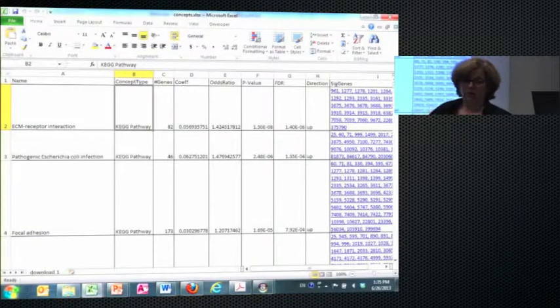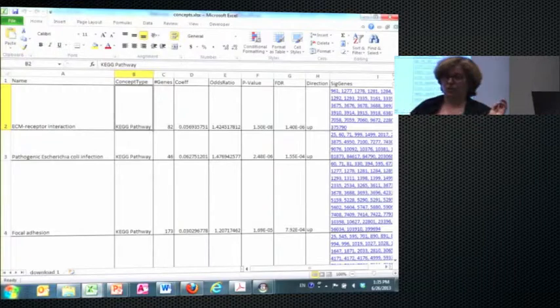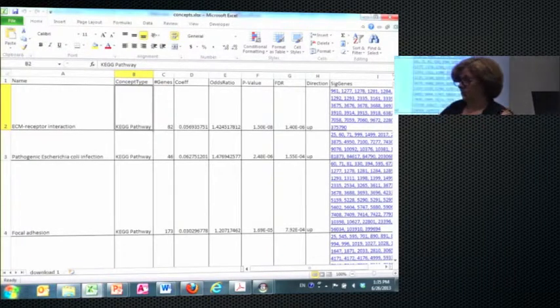This can be pathways, or any other groups. I can define any arbitrary groups of metabolites or genes, and I can use them in enrichment testing. So we're avoiding the term pathways here, and we prefer to use the term concepts.